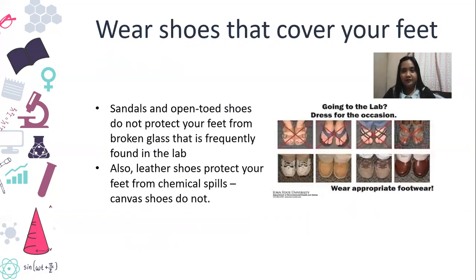So here, a while ago I was talking about shoes. Wear shoes that cover your feet. Of course, this is a little exaggeration. Of course, you won't be able to go to a class if you're wearing sandals, even if it's raining and it's a laboratory class. Just bring shoes with you that are not open-toed, or bring your school shoes.